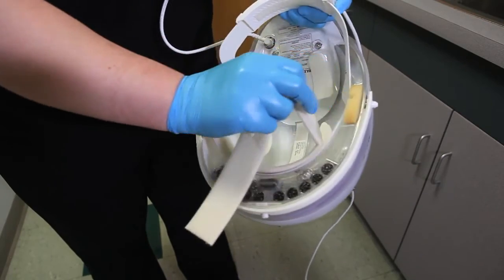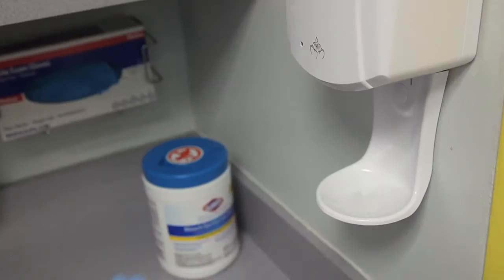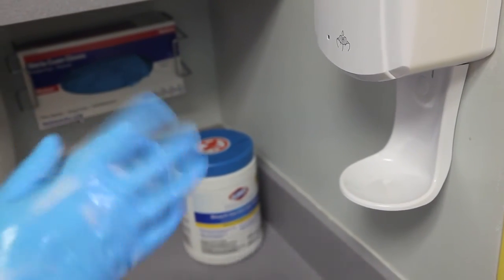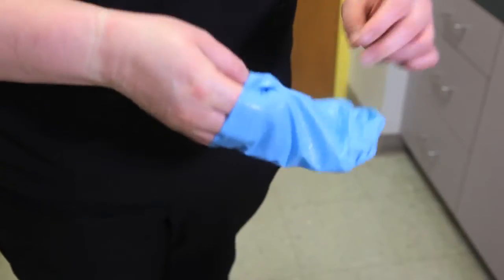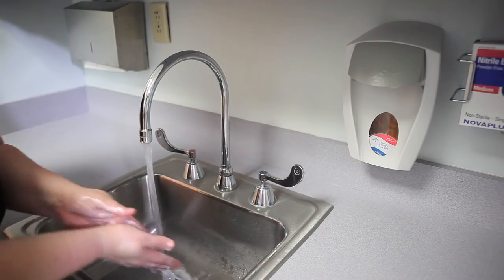Remove comfort strips. Put away capper. Sanitize gloves and allow hands to dry before moving to the next step. Remove gloves. Perform hand hygiene with soap and water.